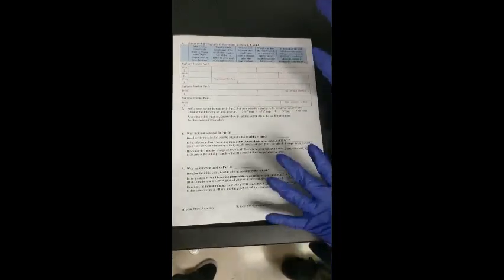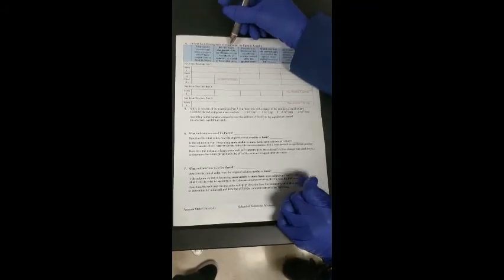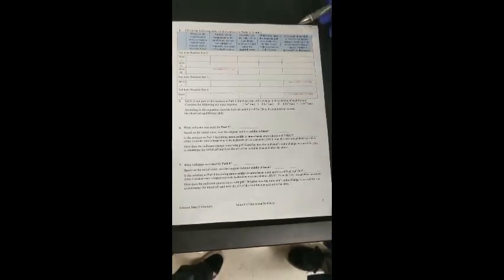But not all the chemical species, or not all the ions, are involved in the equilibrium, right? So please describe what kind of ion is involved in the chemical equilibrium in the next column. And then, just as in the previous example, please describe the color and direction of the equilibrium shift, and please explain why the equilibrium shift is brought.